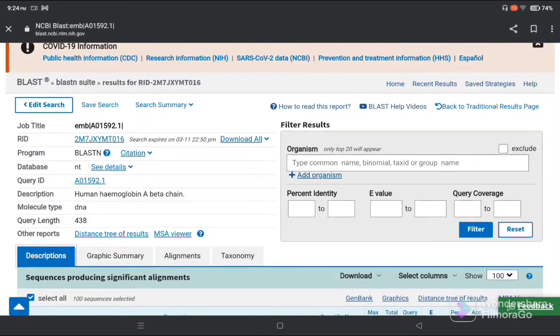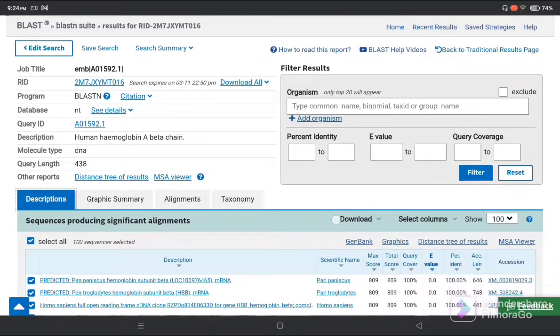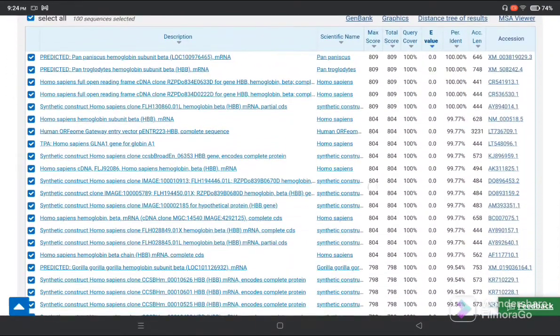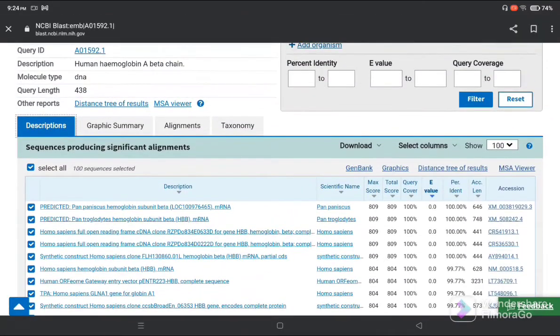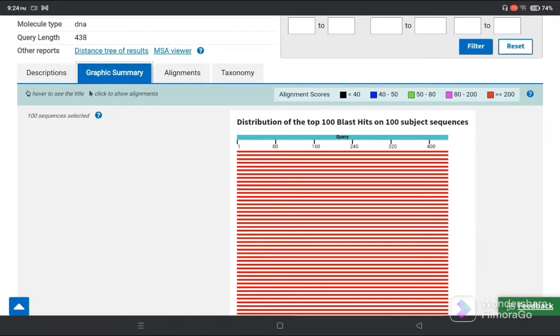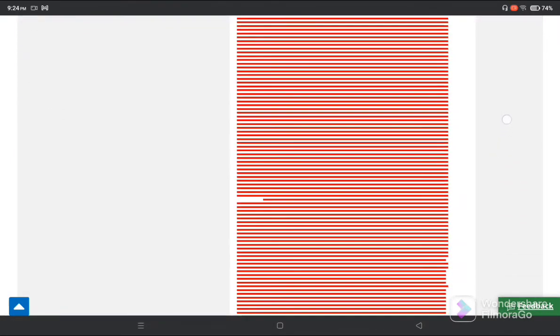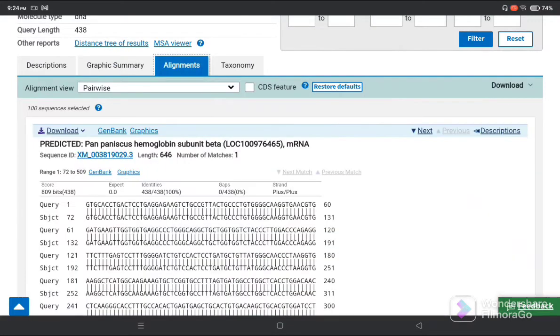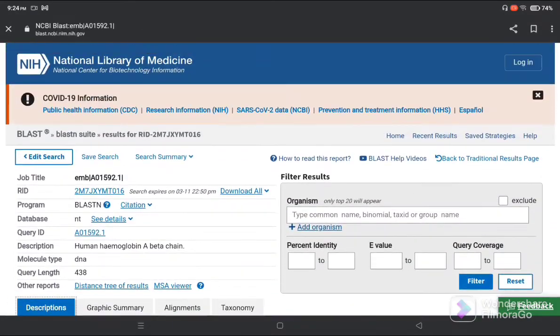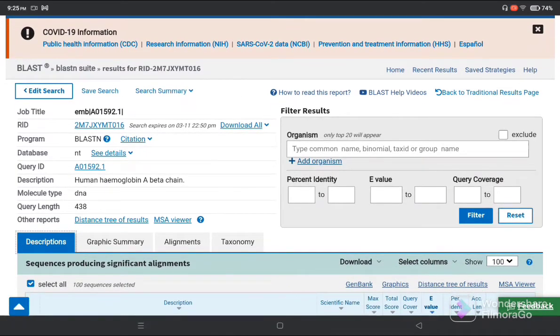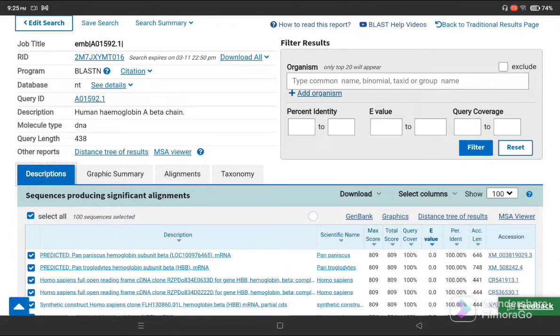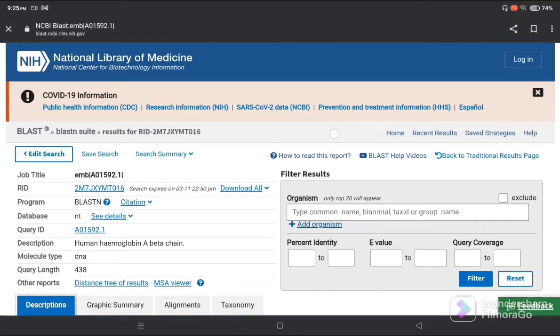It's not a very difficult question. If an unknown sequence is given, you should find the similarities and show these results. Take a screenshot of the description and make a particular file and save it. Again, take screenshots of the graphic summary, alignment, and taxonomy. In this way you can know the similarities of your unknown sequence with the database already present in NCBI. I hope you all understood today's video.